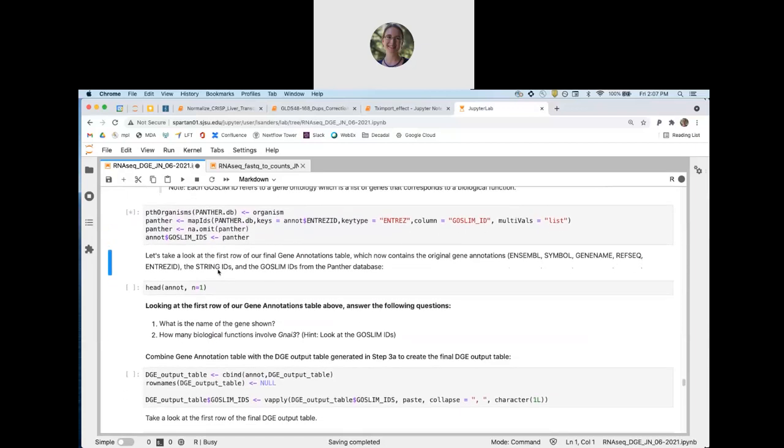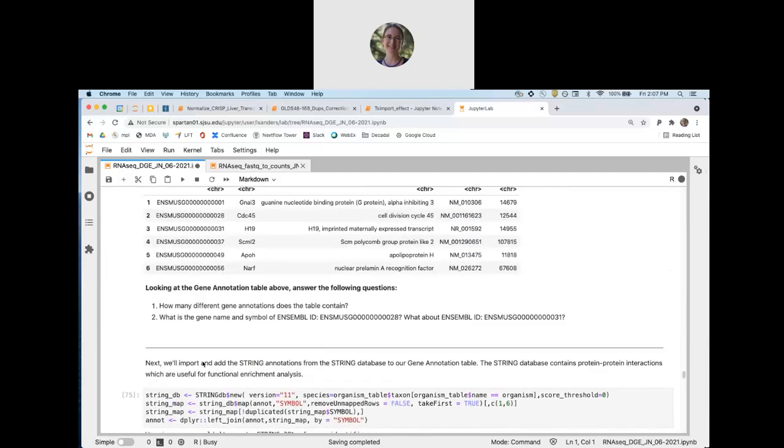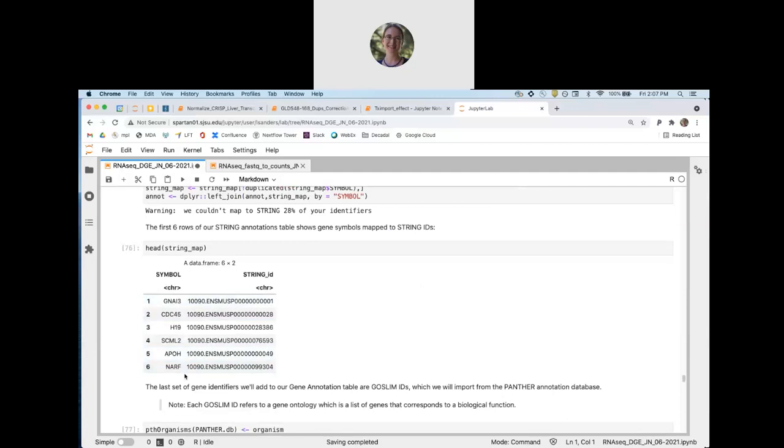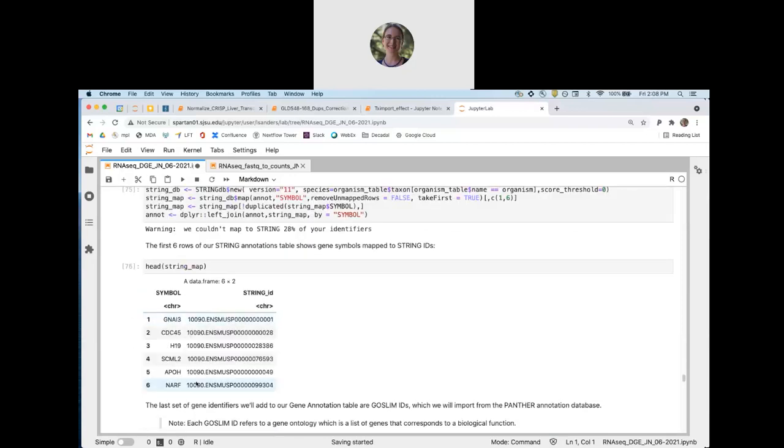How would you check for the non-coding RNAs, Lauren? I don't know exactly what you mean by check, but I can start to answer that question by saying that there are lists of known non-coding RNA. So I have my string database. I would take all of these gene names and then figure out which gene names from the original table aren't found in string.